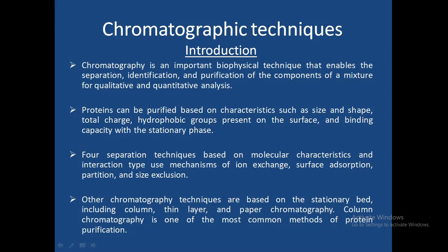Chromatography is an important biophysical technique that enables the separation, identification and purification of the components of a mixture for qualitative and quantitative analysis. That means it is possible to identify and separate the compounds using chromatographic techniques qualitatively, as well as this technique has been used for quantifying the compounds also. And for the separation of biomolecules like carbohydrates, proteins, fats, we can make use of these various types of chromatographic techniques.